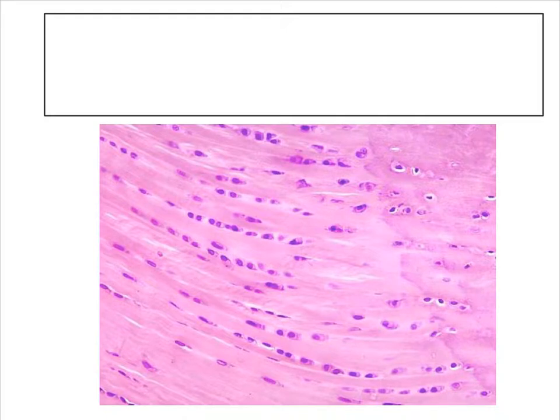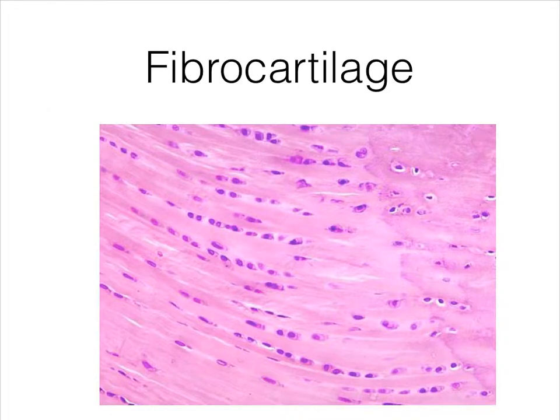All right, and last one. This is fibrocartilage. You can tell because of the thick collagen fibers running parallel.